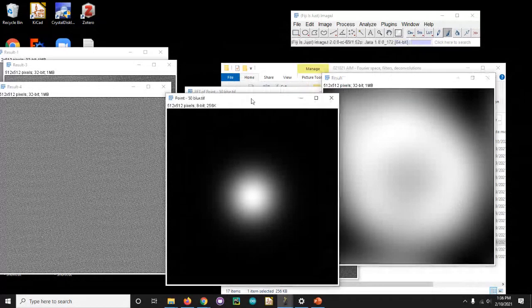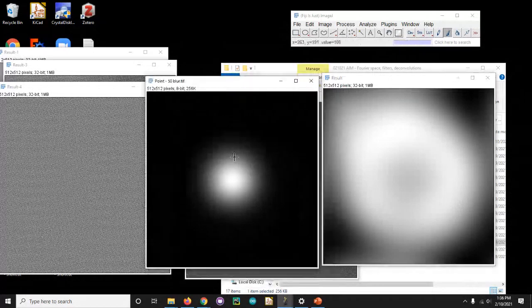And the other thing to keep in mind is the other huge advantage is the point spread function. In this case, this is a simple convolution, the same across our entire sample, which is not true in the real world. So that's two things against us. One, we cannot collect billions of photons for every single pixel in the image. Our fluorochrome is going to be long gone. The sample is going to be incinerated. You basically cooked it.